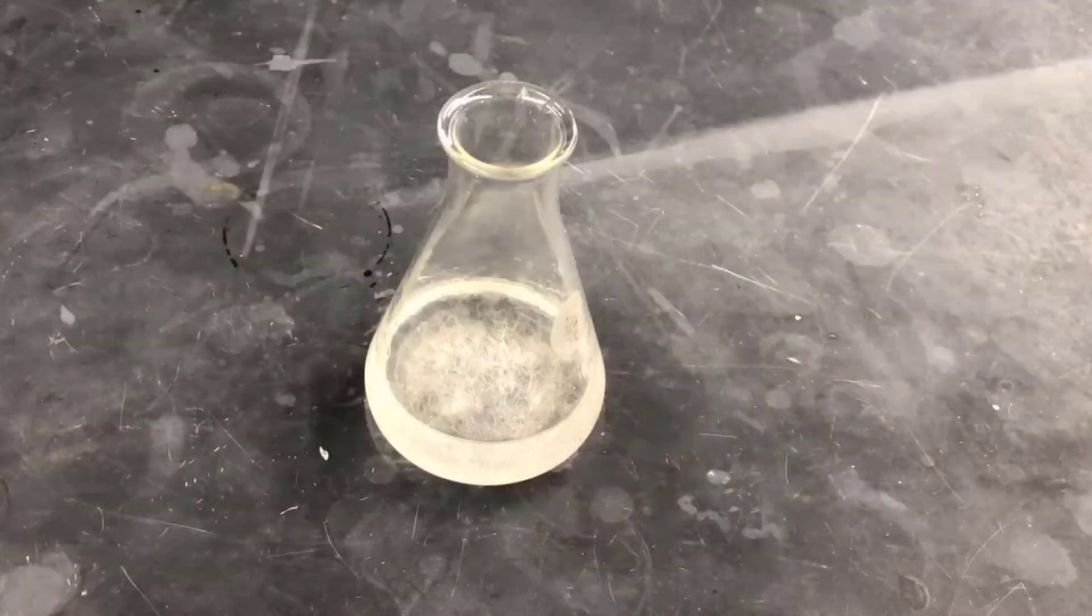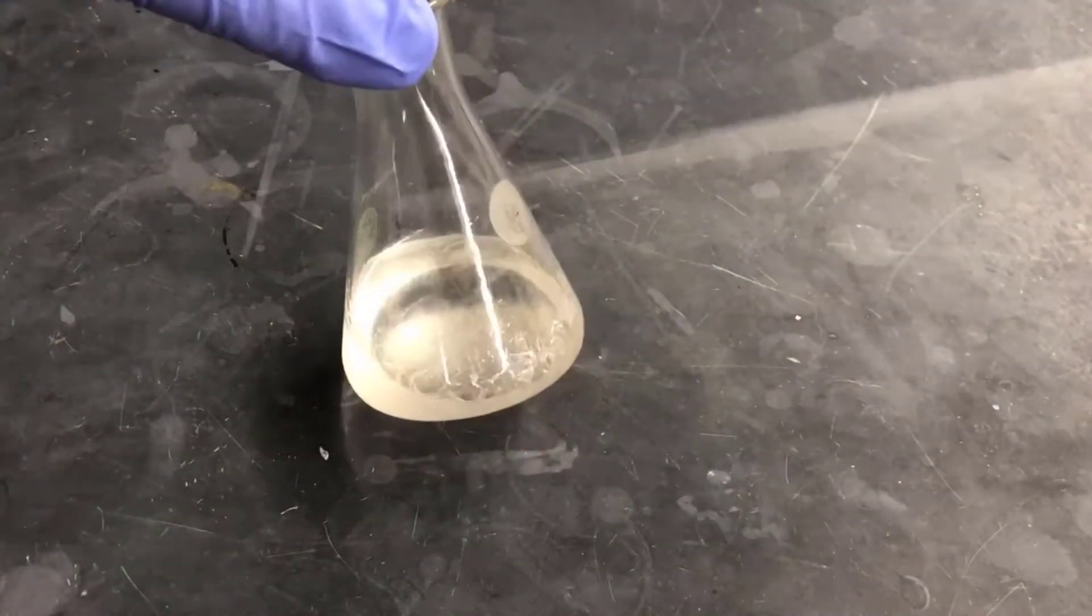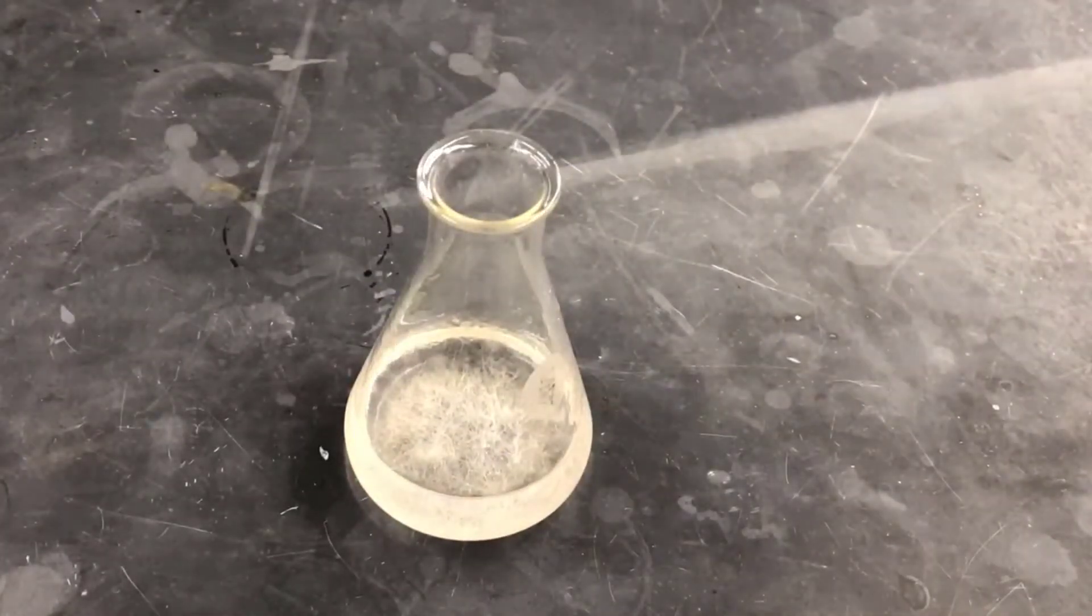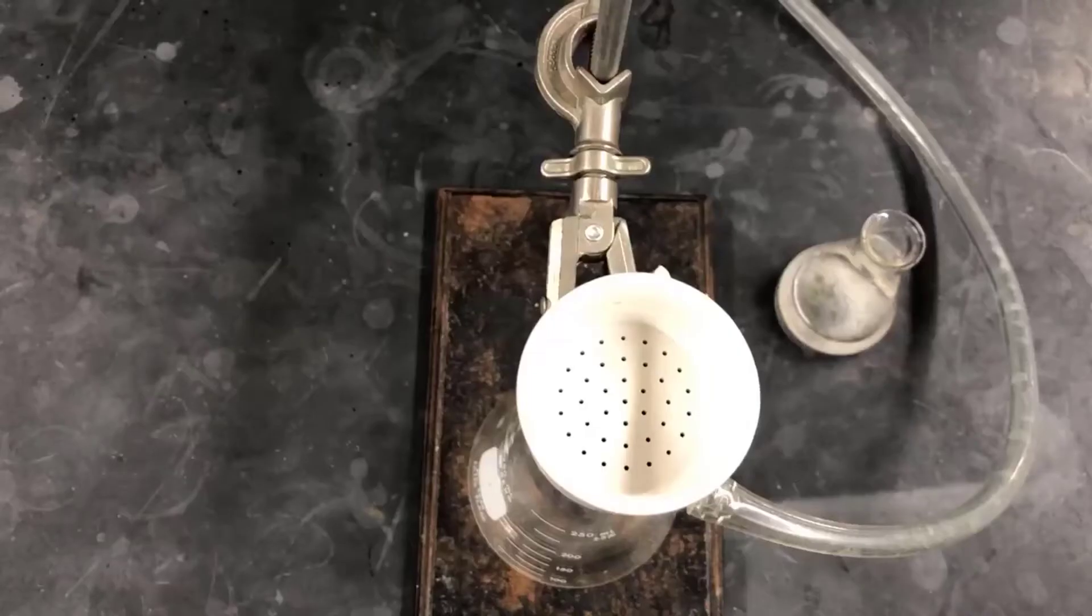Now the recrystallization is complete, and I have a flask full of colorless needles of the Diels Alder product, tetrahydrophthalic anhydride. I'll vacuum filter these crystals like I did before.